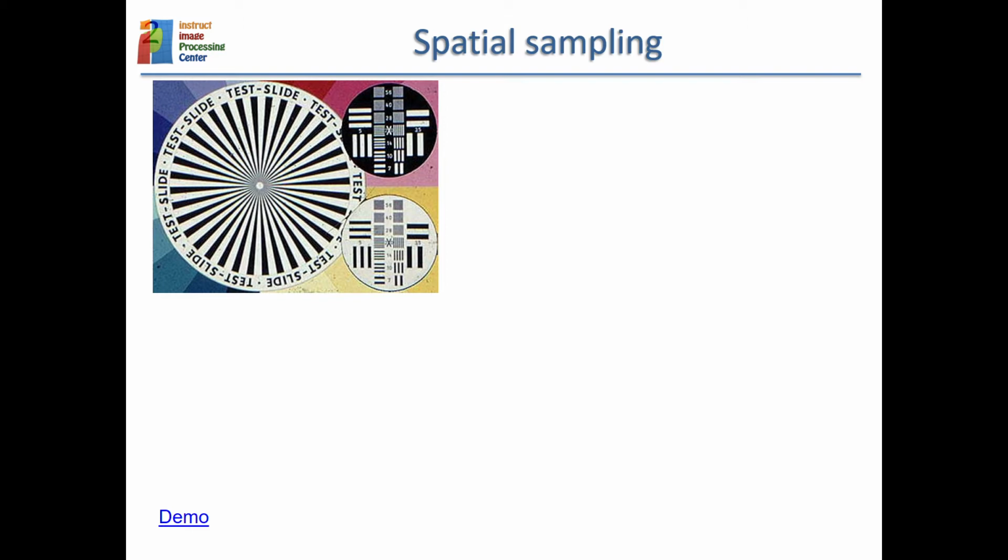And our eyes are very bad, or are low pass filters, and that is why when you look at the distance, you cannot see the very fine details. You have to get closer to see the fine details, because your eye doesn't have infinite spatial resolution, and then it cannot follow the going up and down of the objects, even if they are there. So for instance, that is what happens if you try to read a book from 50 meters away. You can see the pattern going black and white is there, but you cannot follow it.